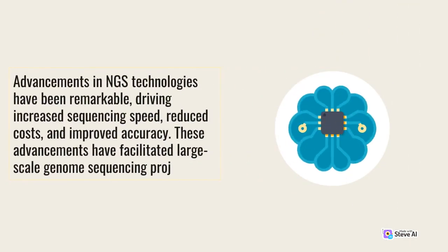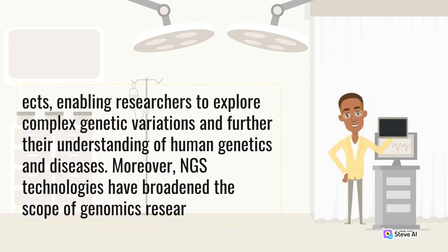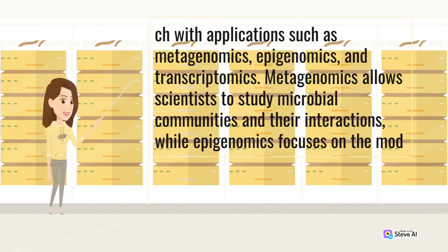Advancements in NGS technologies have been remarkable, driving increased sequencing speed, reduced costs, and improved accuracy. These advancements have facilitated large-scale genome sequencing projects, enabling researchers to explore complex genetic variations and further their understanding of human genetics and diseases. Moreover, NGS technologies have broadened the scope of genomics research, with applications such as metagenomics, epigenomics, and transcriptomics.